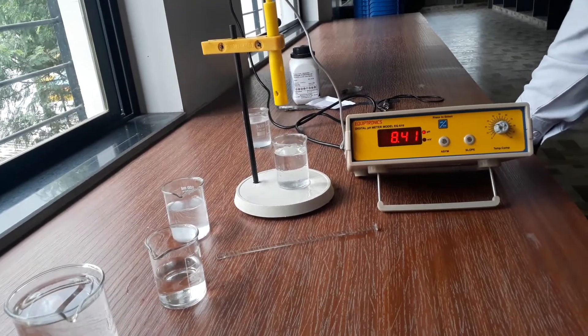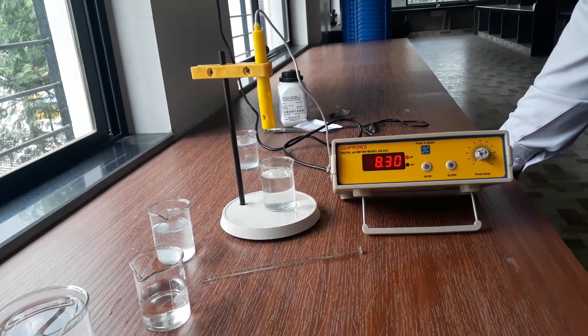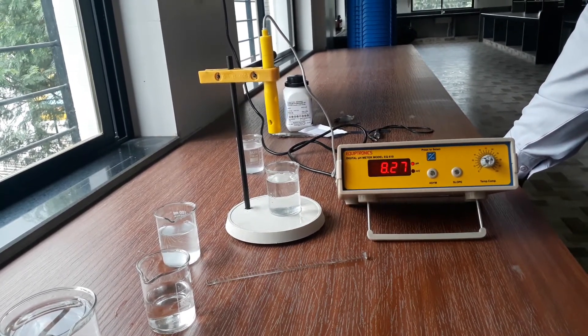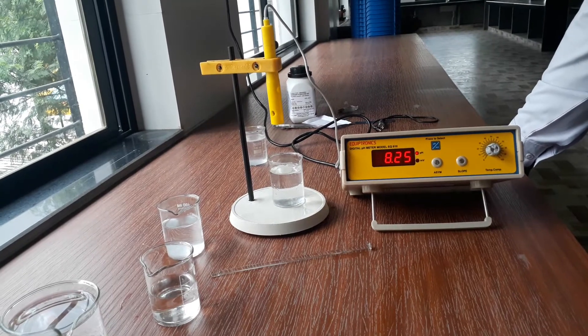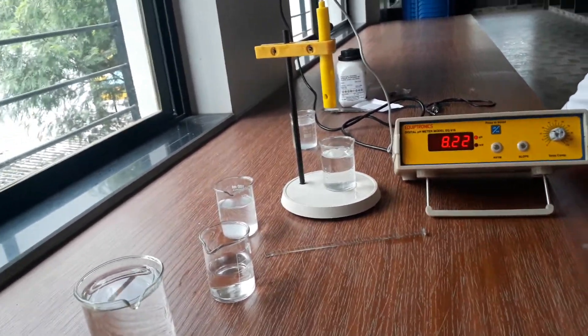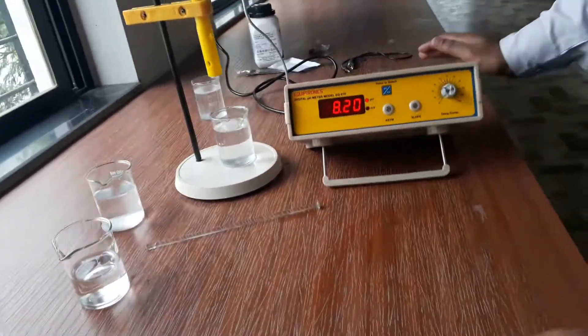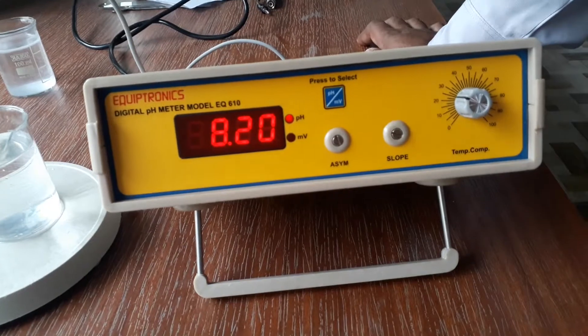Hello students, today we are going to learn an activity. This is just an activity you had, you don't have to write this in your journal. So we are going to study about pH meter. pH you already know, power of hydrogen or potential of hydrogen. So this is a pH meter which is the most accurate technique for measuring pH values of any solution.